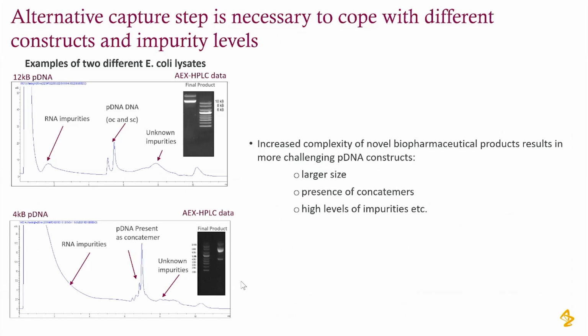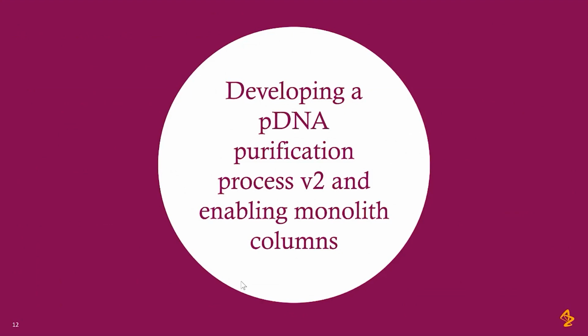So that's why we started developing a pDNA purification process version 2, where we started implementing monolith columns. First of all, in order to develop a new purification process, we obviously didn't know that we would end up implementing monolith columns.